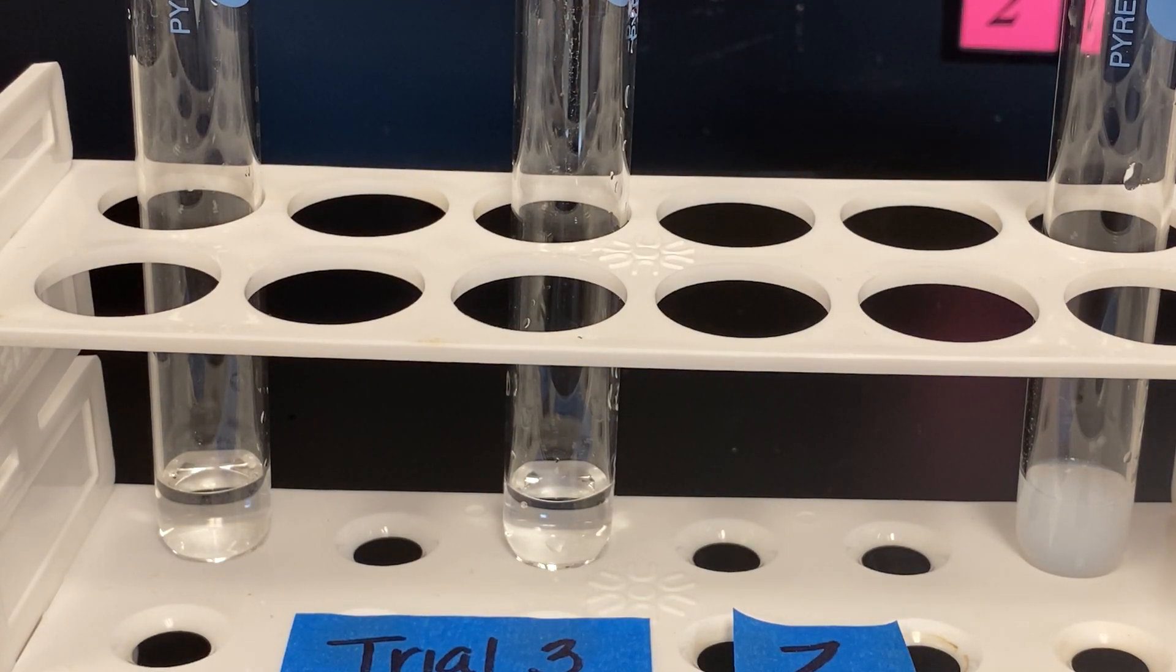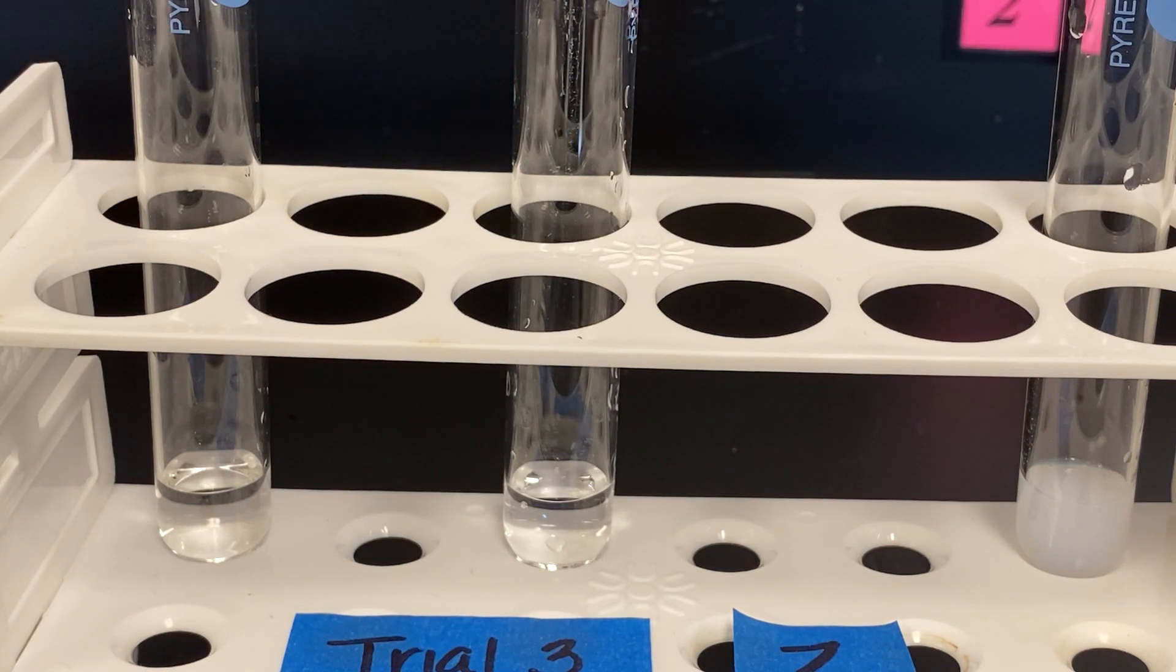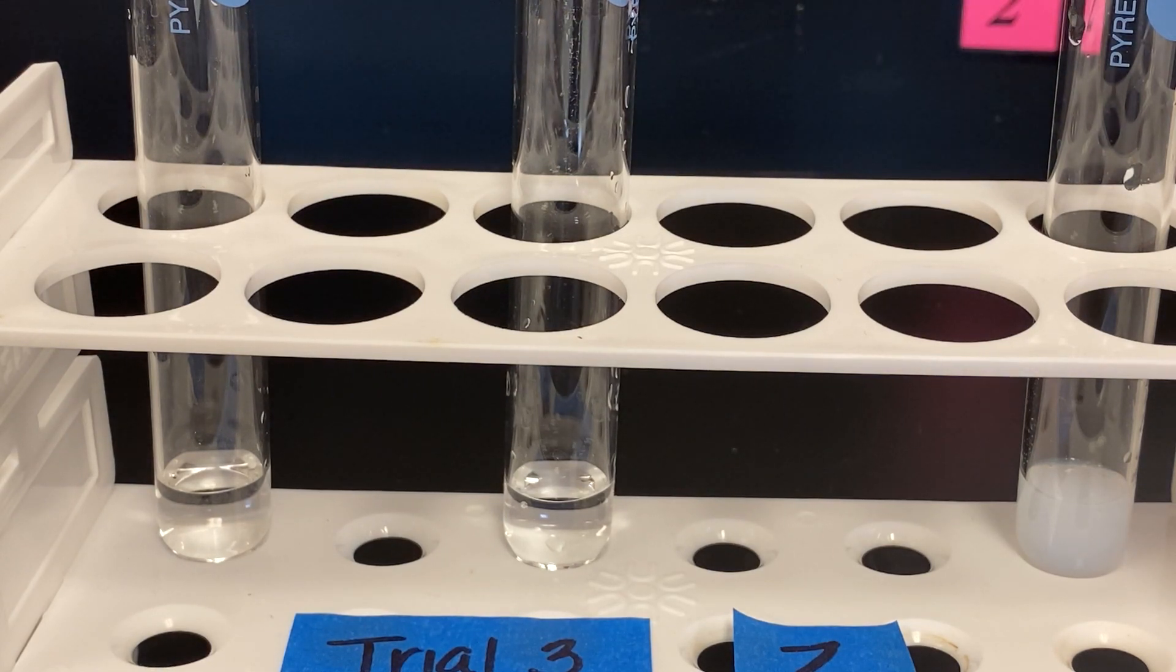Ensure that you've documented what you observed during each trial. Ensure that you annotate which test tube had which solution mixture. Using the scientific method for Step 3, you will complete a brief lab report using complete sentences. Be as specific in your observations as possible.